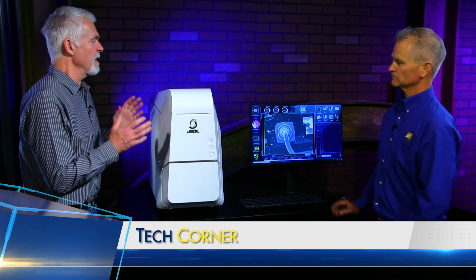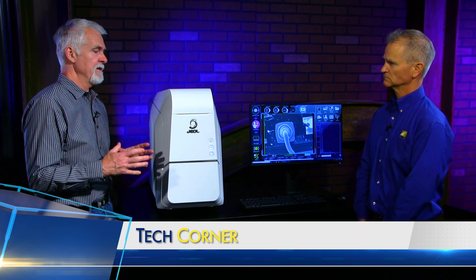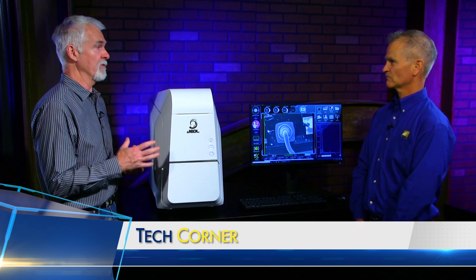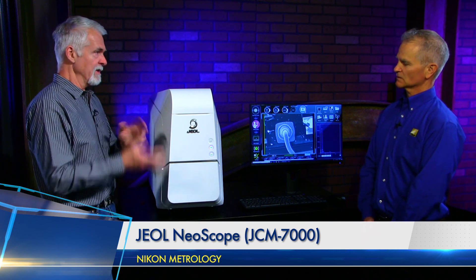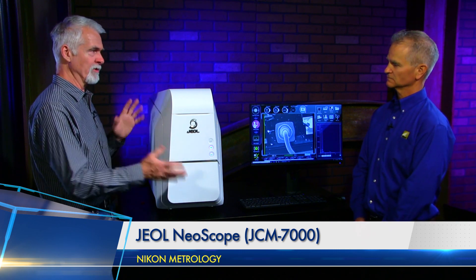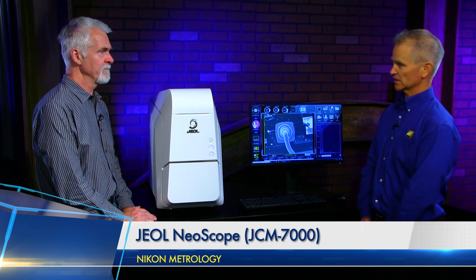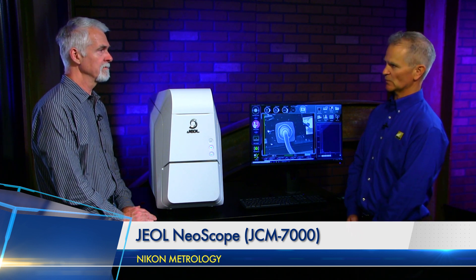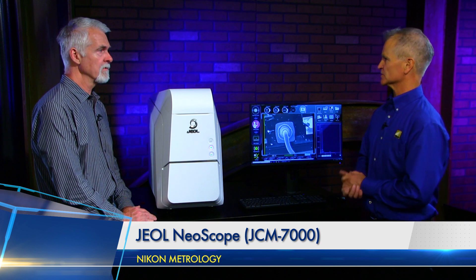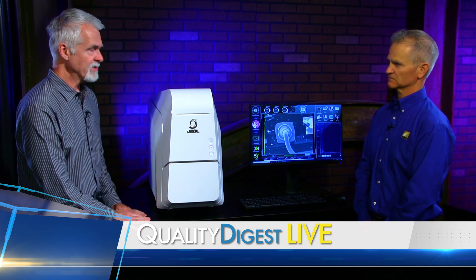I was just thinking — the image you get, is it like a point cloud where you could bring it into point cloud analysis software? This does have the capability to show the sample in three dimensions, and there's an additional software called Smile Map that will allow you to display that in three dimensions as well. This is the JEOL JCM-7000.